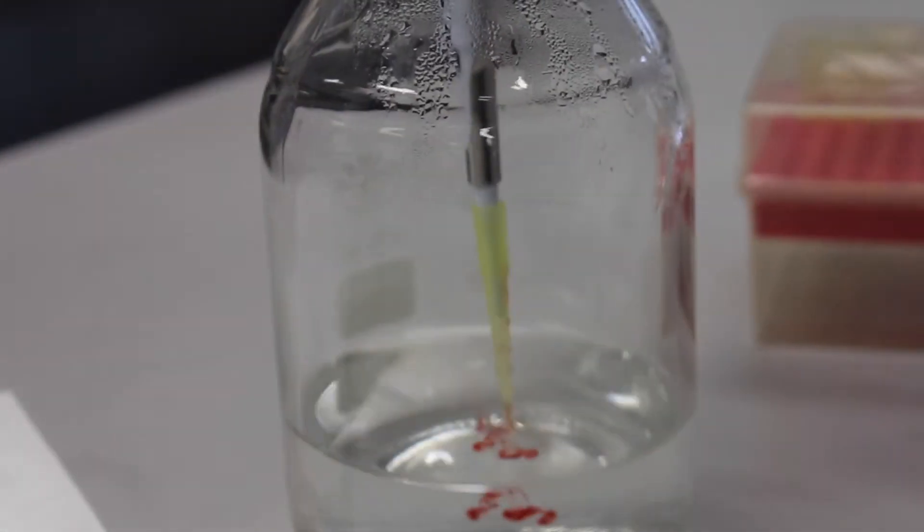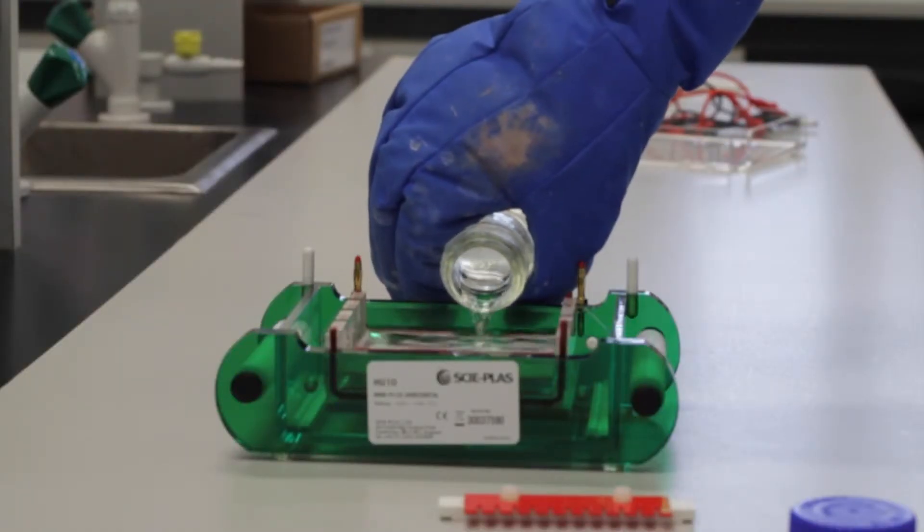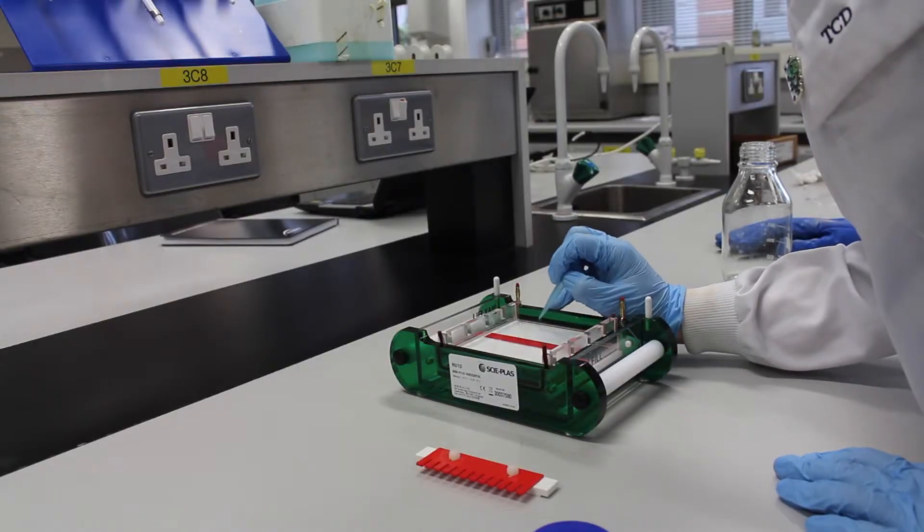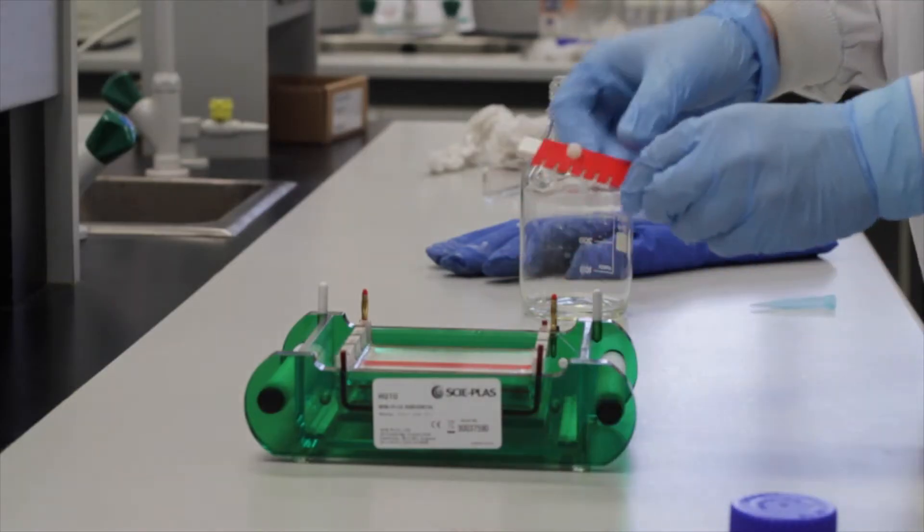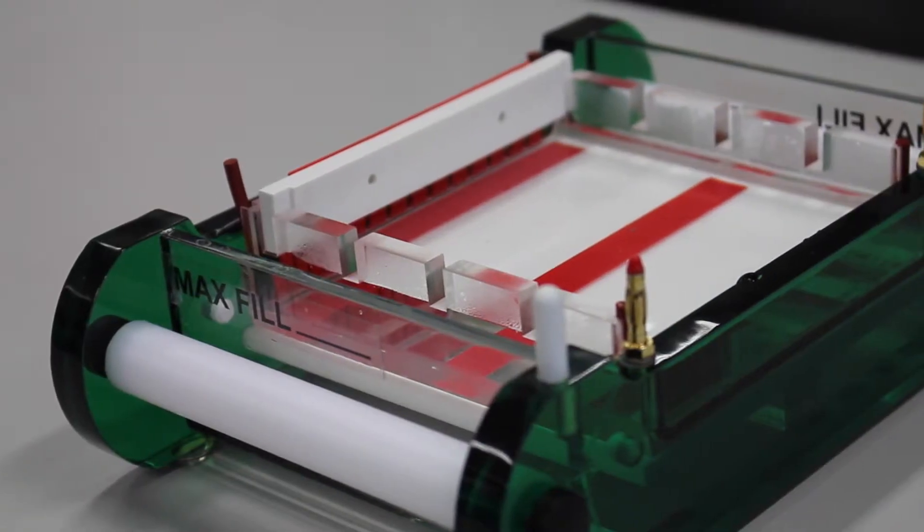15 microliters of gel red is added to the solution. The gel solution is now poured into the gel tray. Any air bubbles are removed with a pipette tip and the comb is added. The gel is now left to solidify at room temperature.